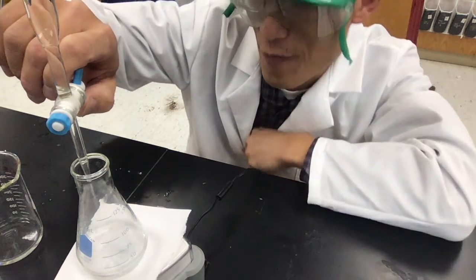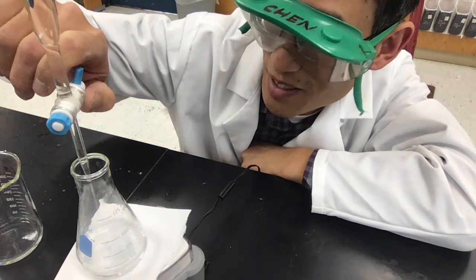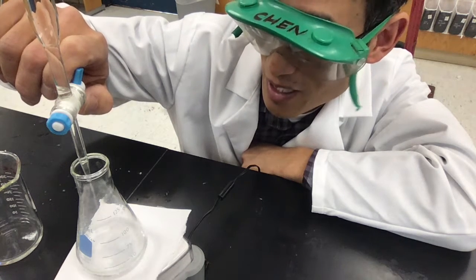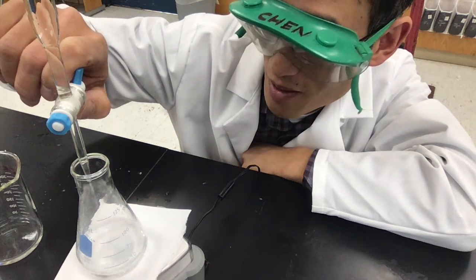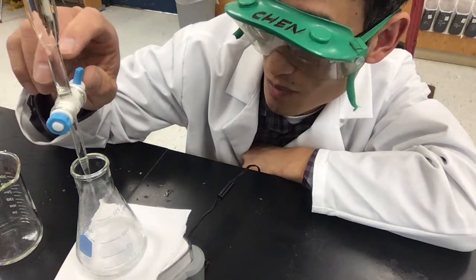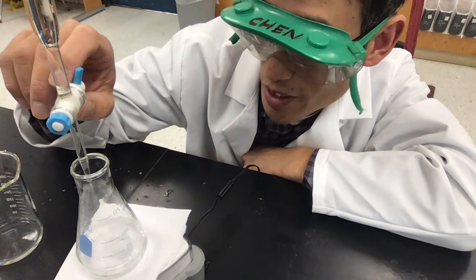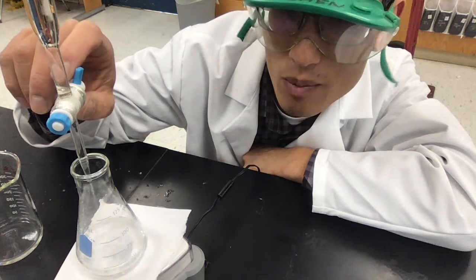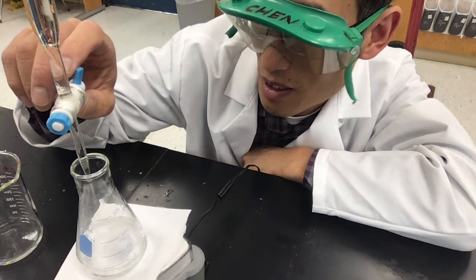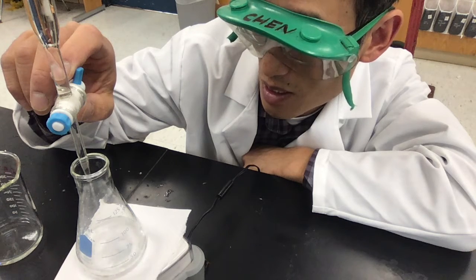My friend in college used to race his lab mates to see how fast they could do titrations. They would blast it through and add a bunch of stuff until it turned. So we're waiting to see if it turns pink, okay? I don't recommend doing that, adding a bunch of things, waiting for it to change, and then adding more acid to get it to change back. Not a good idea. But you want to see how we're doing here.